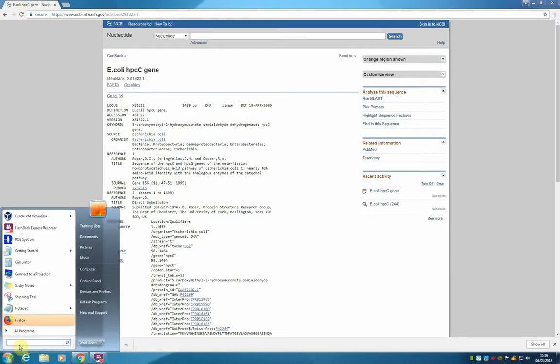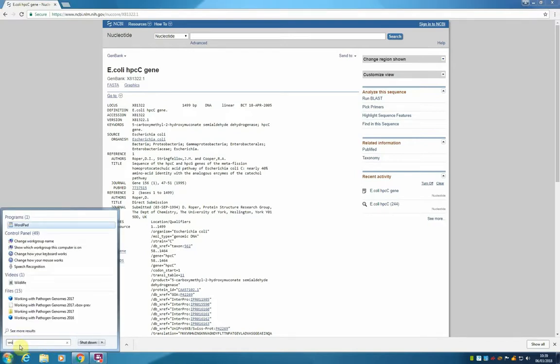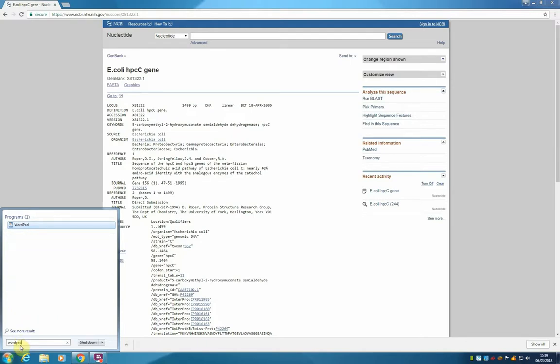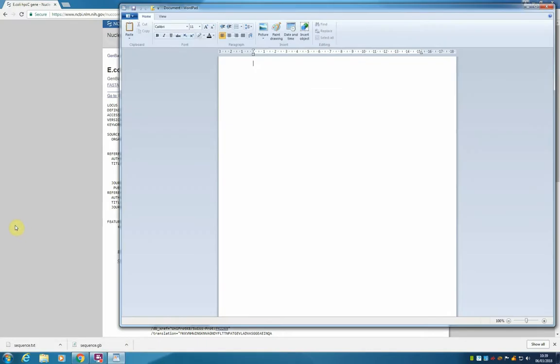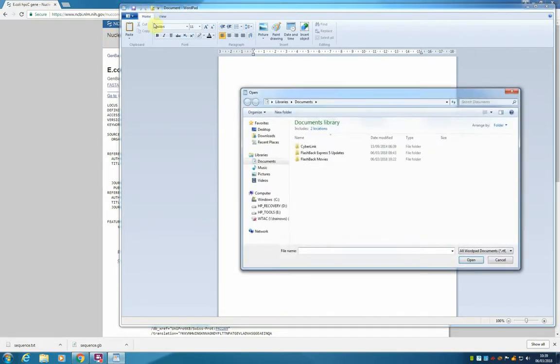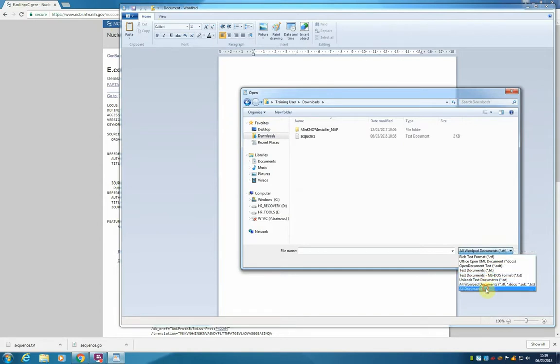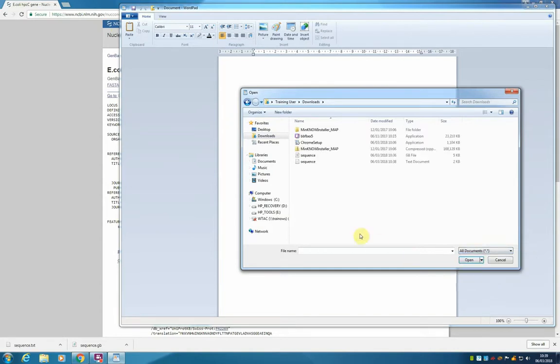We are going to open WordPad, or if you already have it open before, you can just use it directly. And from here, going to the downloads folder, and again I need to change to see all documents. And this is our other sequence that has a text document type.